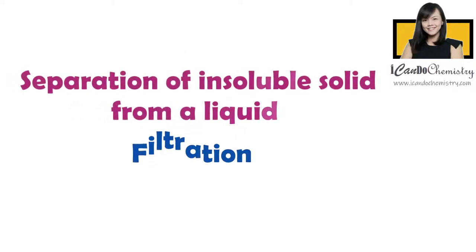In this video, we will focus on separation of insoluble solid from a liquid.